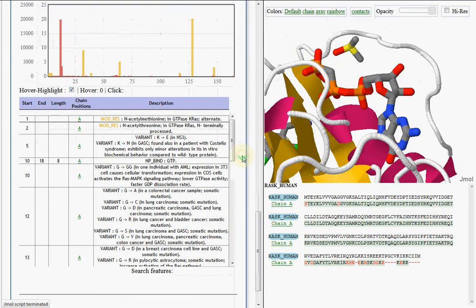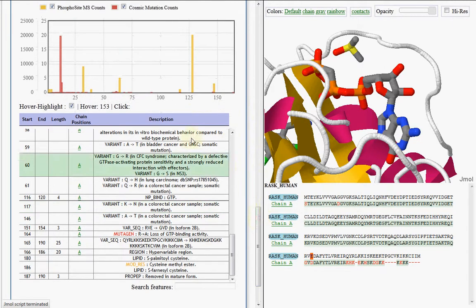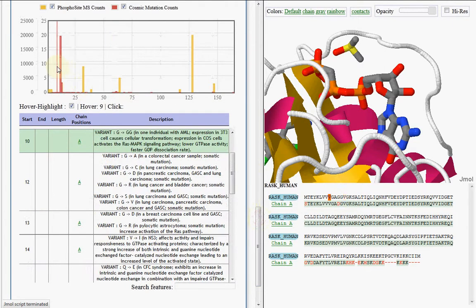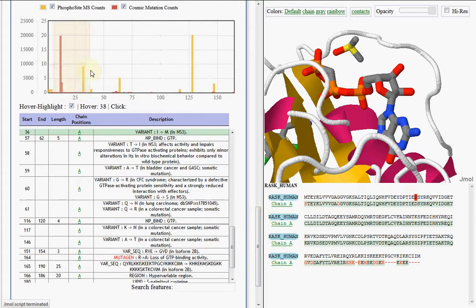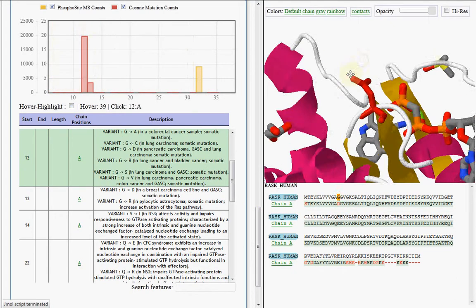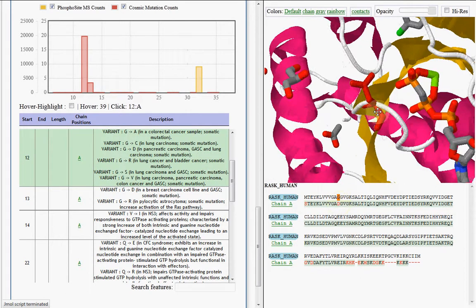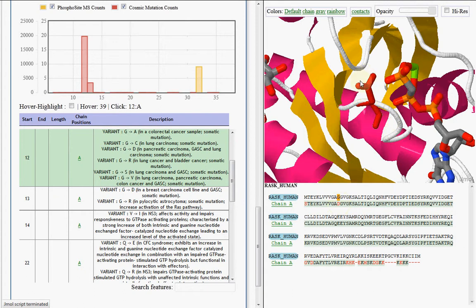You also get more sequence annotations as before, such as the count data and this table of annotations. However, now this information is completely interactive. By clicking on these mutation peaks, you can see precisely where the amino acids are located. So for example, this glycine residue in the native sequence is mutated to an aspartate in cancer and in the Protein Data Bank, precisely because the authors were determining the structural characteristics of this cancer mutation.